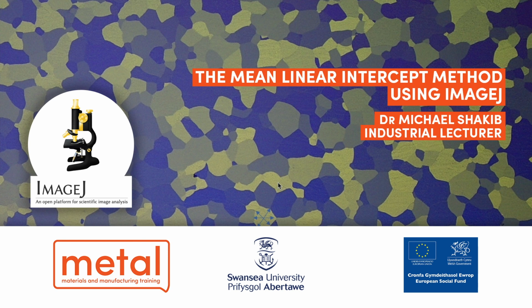Hello everybody, this is Michael Shakib from Swansea University and Project Metal, and today I'm going to go on to the final video of the mean linear intercept method and talk about how we can do it using a free bit of software called ImageJ.